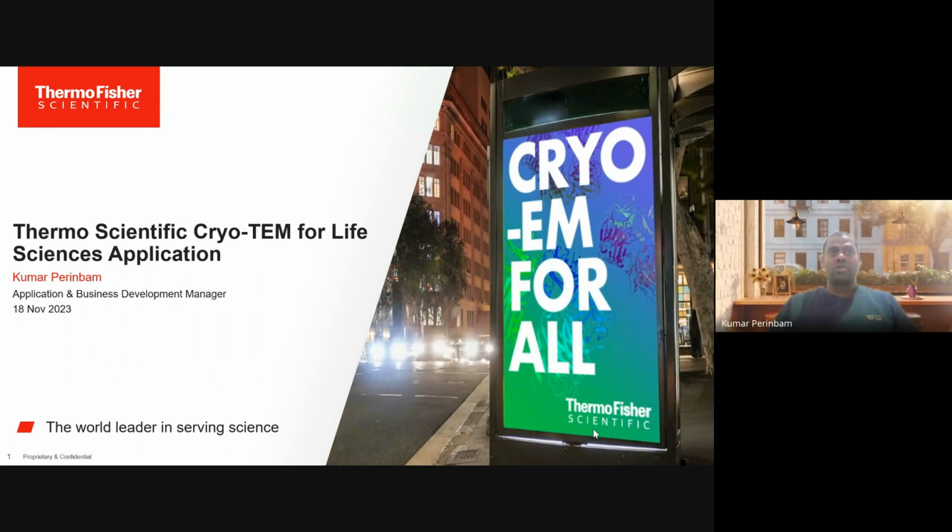As you might be aware, you would have learned a lot from professors and previous speakers like Natesh and others who have been constantly involved in the application side, where they use cryo-EM. While I am from the company Thermo Fisher, where they play a decent role in developing the tool in such a way that it can be used by many biologists, especially structural biologists. I will be trying to convey some of the historical perspective of how these tools were developed.